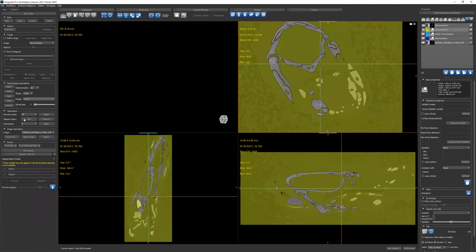Then we have these operations down here, image operations. You must change this to your other data set. This is the data set we're going to manipulate. I changed it to neurocranium and I want to override it. And what I override it with is a value of 0. And then you hit OK.